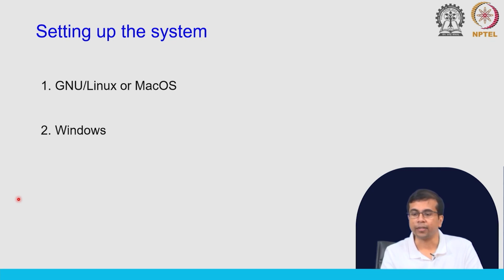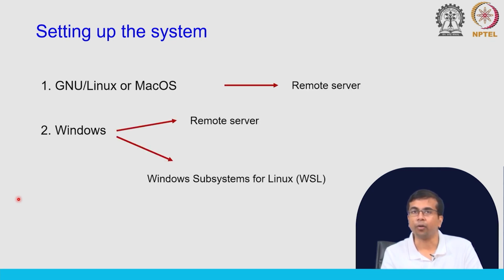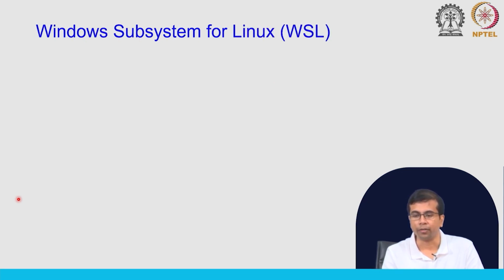Now, in Linux systems you can also log into remote servers and do this work. Most of these remote servers are set up on Linux based systems. So, you would have to know some of these commands that we can use for running all the tools that we use in NGS data analysis. So, just a brief word about Windows Subsystem for Linux or WSL.